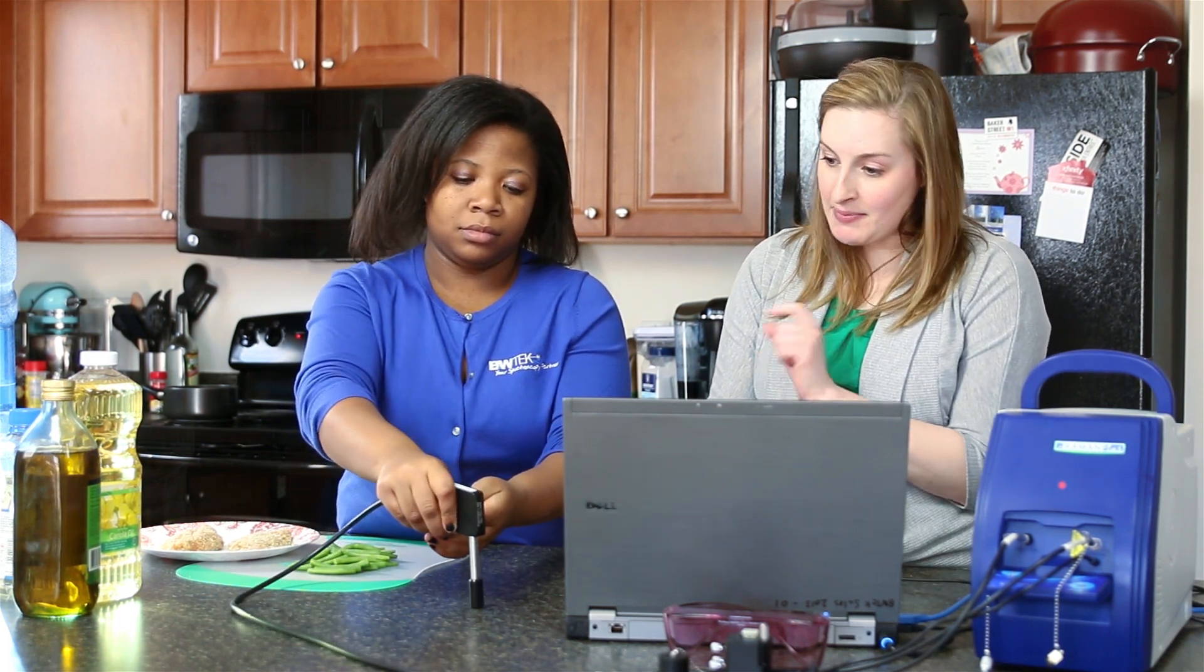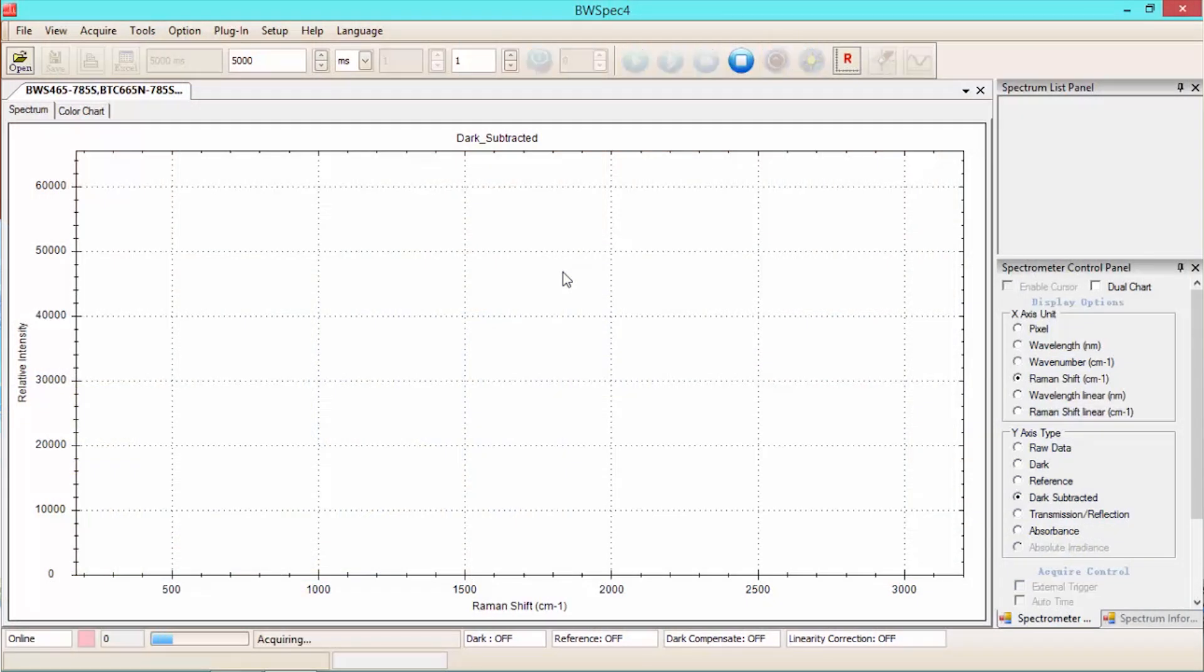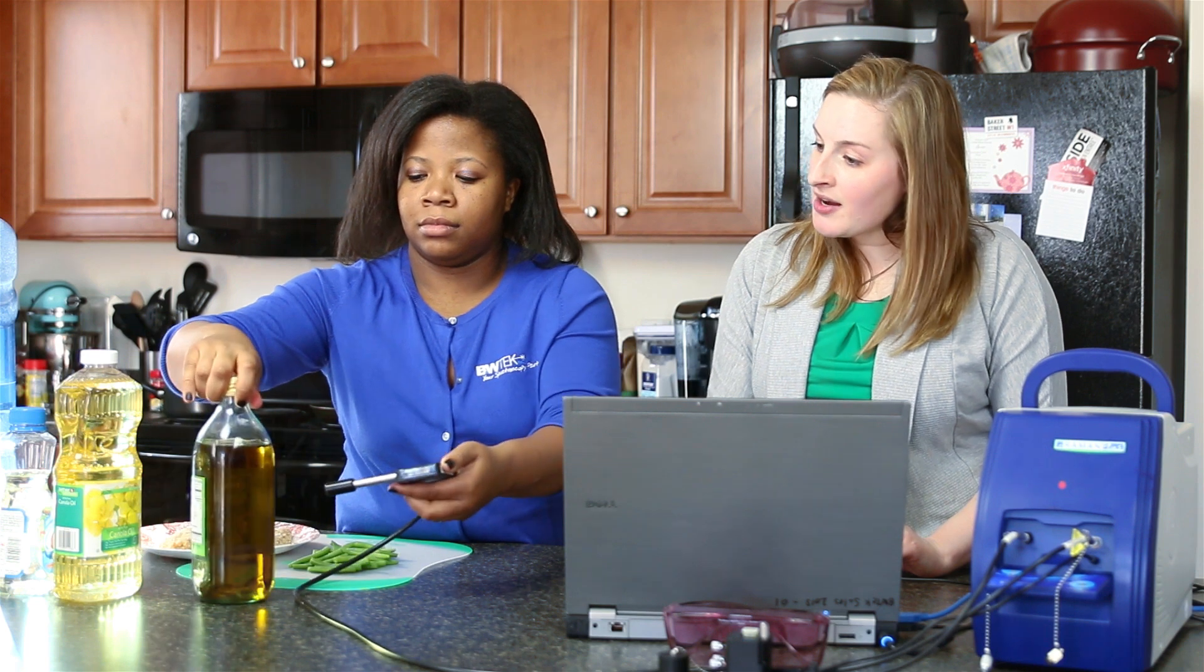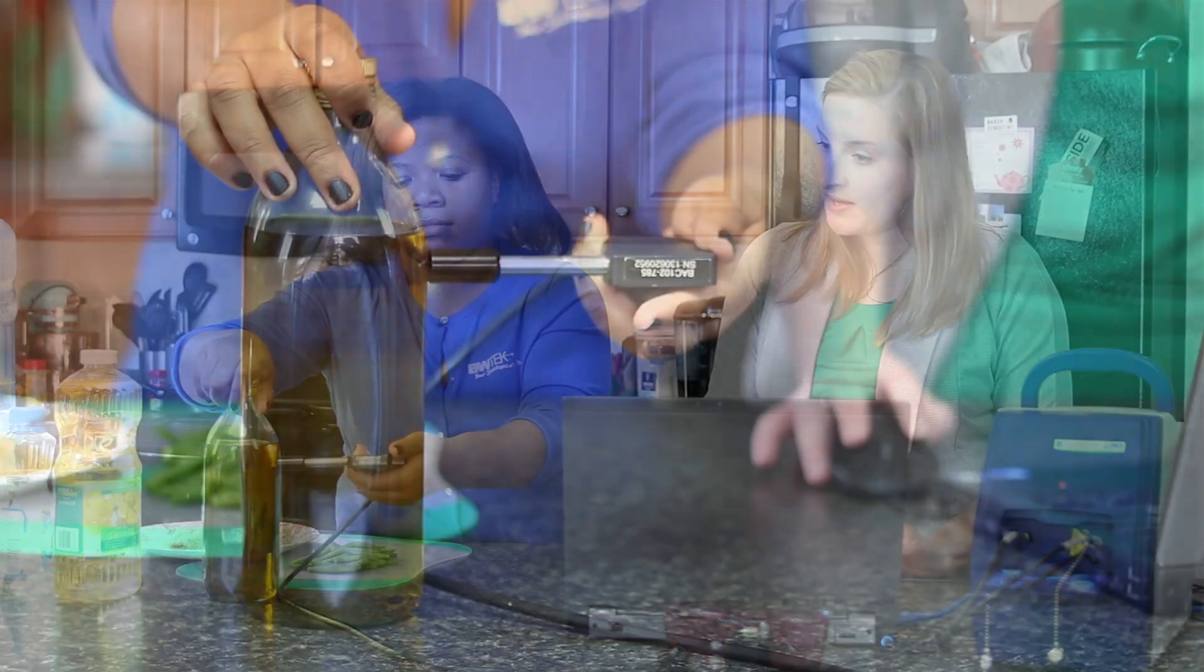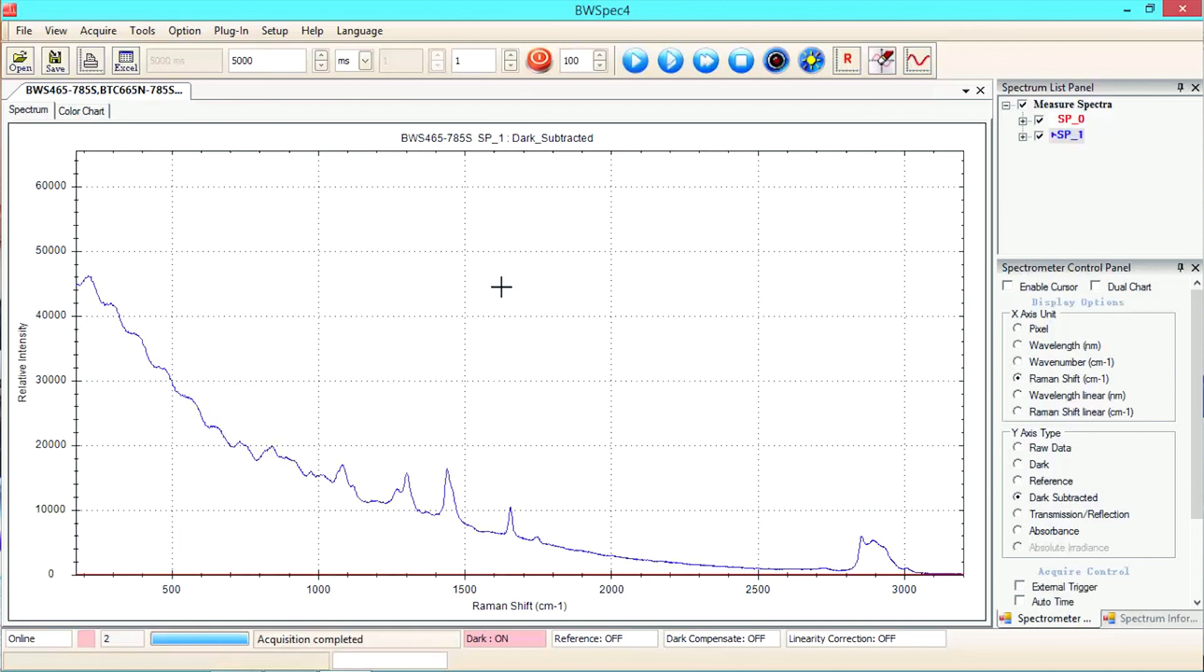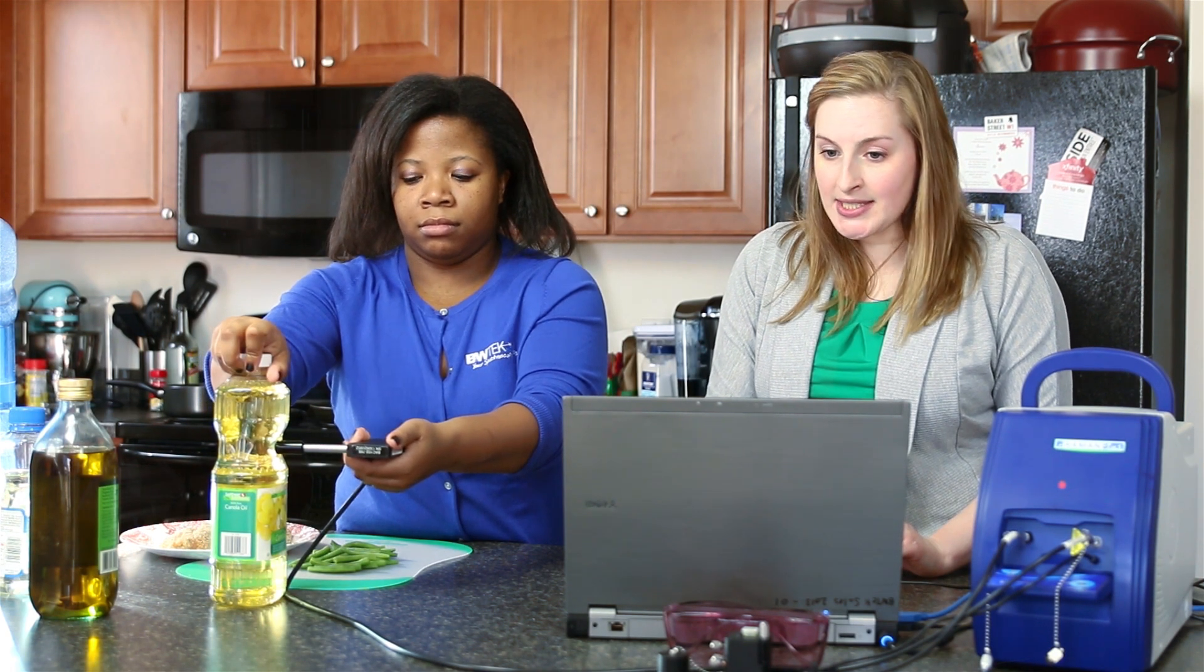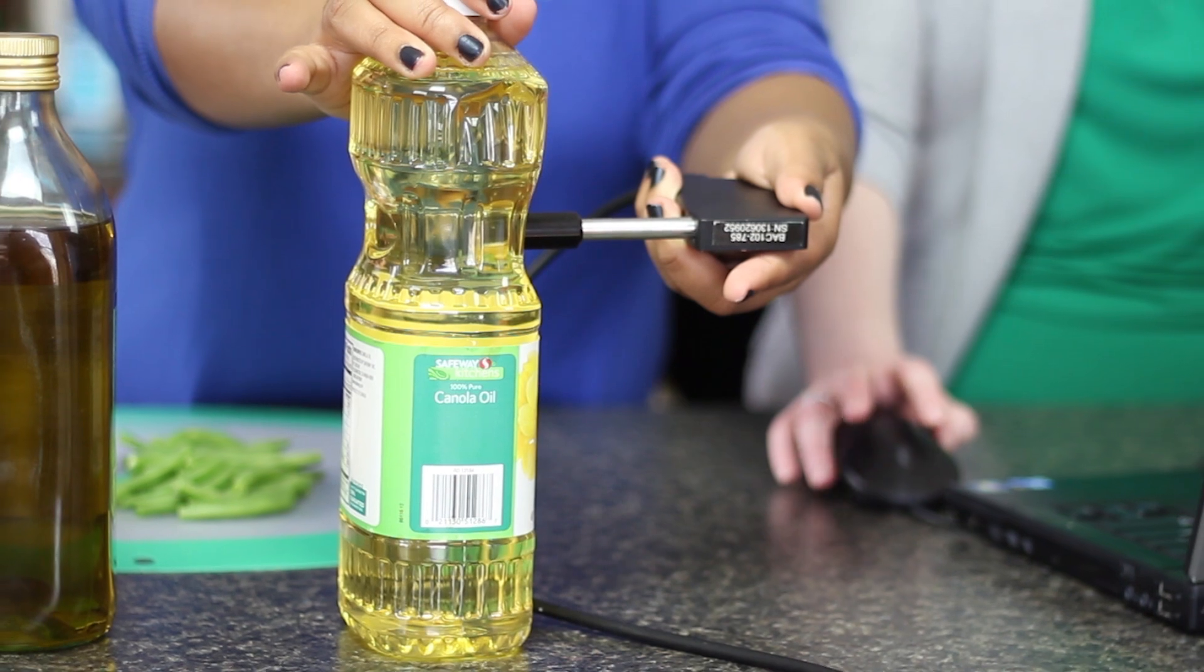So we'll take a dark scan first, make sure that the shutter is closed, and we'll go into BWspec here and take the dark scan. Okay, and then we can grab the olive oil there and take a scan of that as well. Okay, and then we'll take a scan of the next one. And we don't need to take dark scans in between because the integration time is the same.